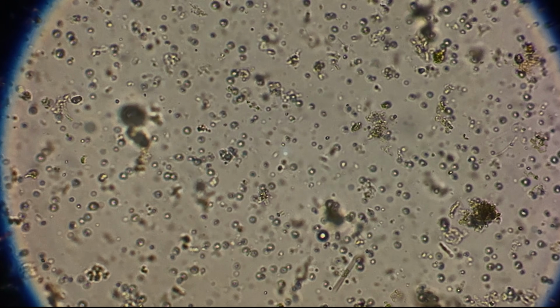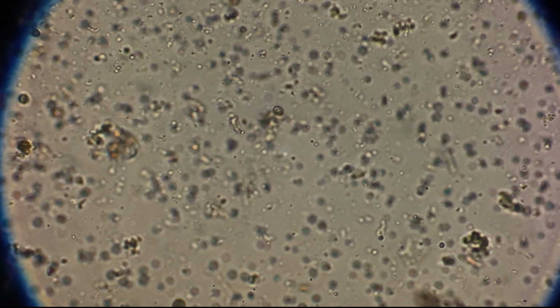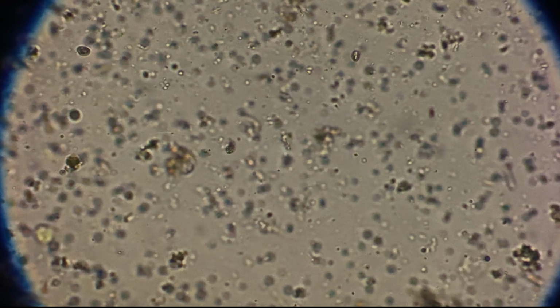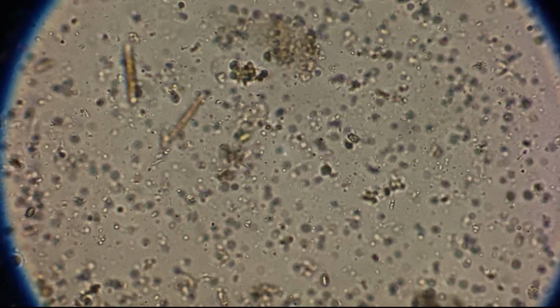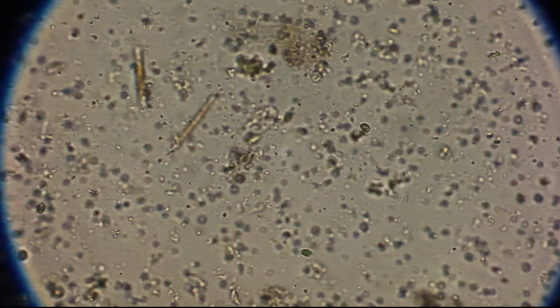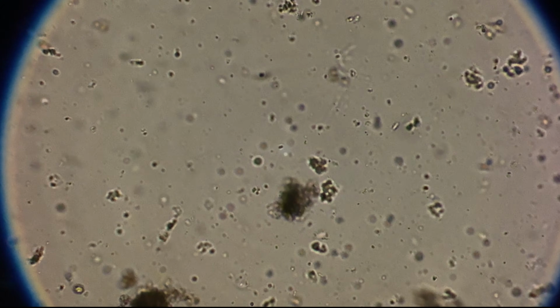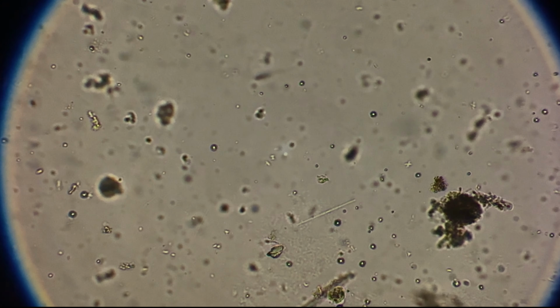Let's check back in on our slide. Whoa, look at this area now. A few minutes ago, this whole region was full of tiny swimmers weaving in and out of view. Now it's almost silent. A handful of organisms are still twitching, still trying. Wait, did you catch that one in the corner? It just kicked back to life for a second.